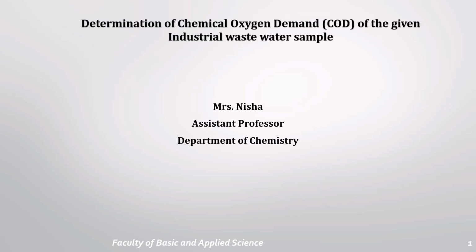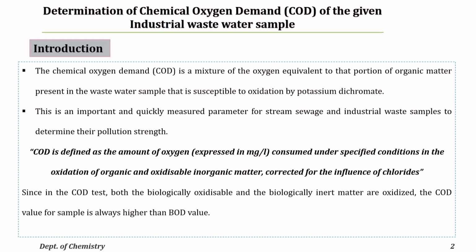Today we will learn about determination of chemical oxygen demand, that is COD, of industrial wastewater sample. So first let us discuss the theory of this experiment. So basically COD stands for chemical oxygen demand.